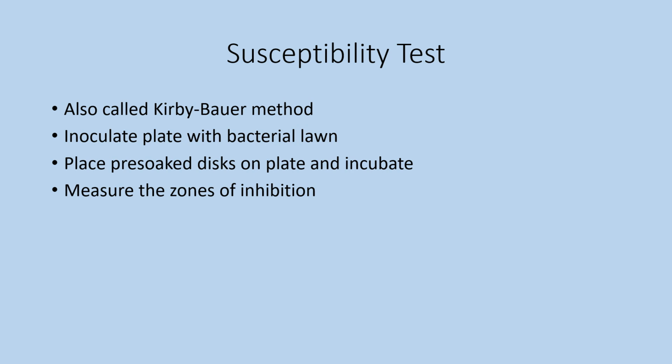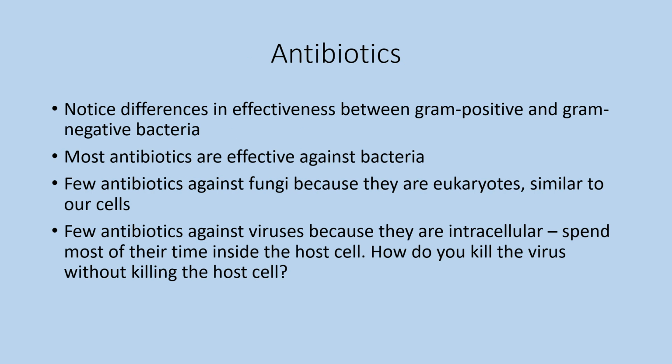And we do see differences between gram-positive and gram-negative bacteria and how they react to antibiotics. So when you go to look at your results, you have worked with 1 gram-positive plus 1 gram-negative bacteria. You would have tested the same antibiotics so that you can compare the effectiveness of them.